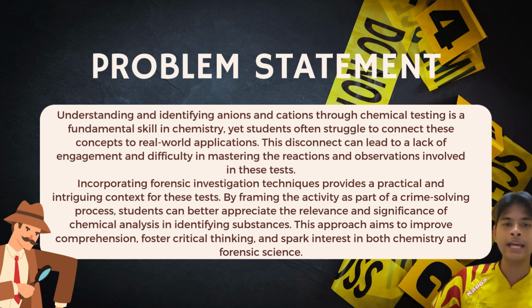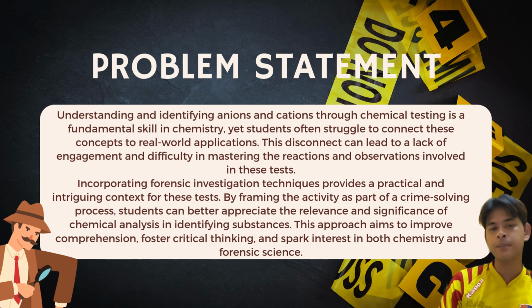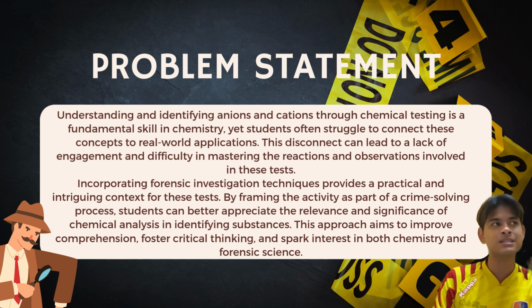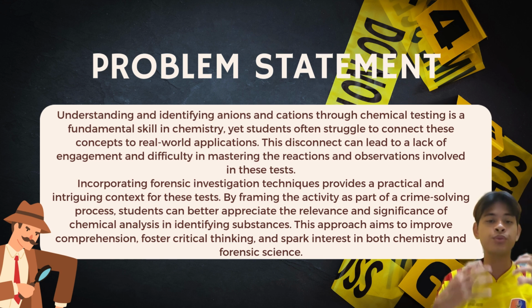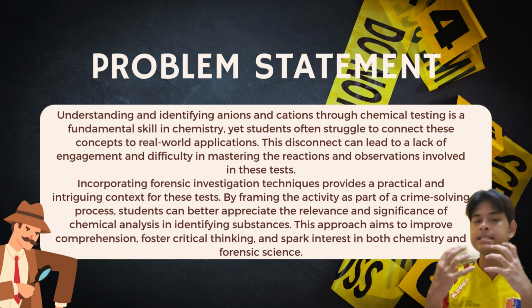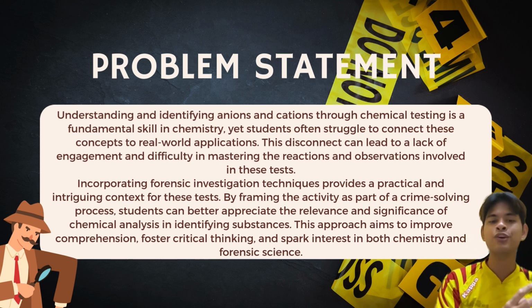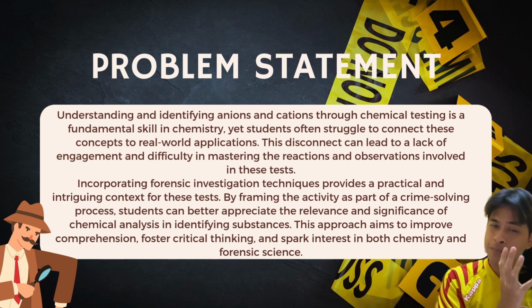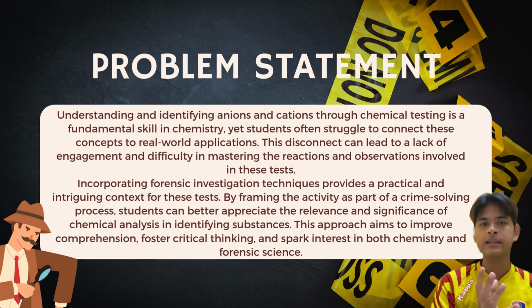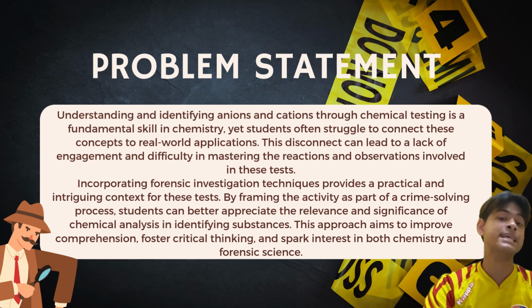By integrating forensic chemistry, which we know is something fun and triggers the critical thinking of our students, we want to make them think and solve cases regarding the anion and cation test, and have a better understanding of the syllabus published by KSSM.